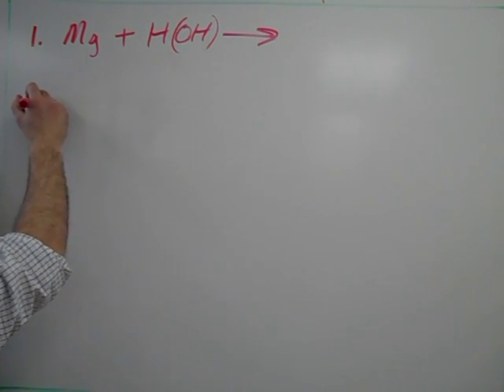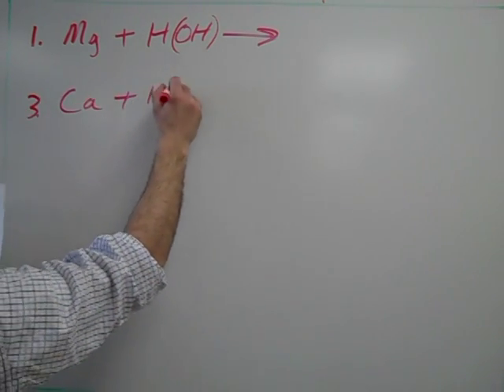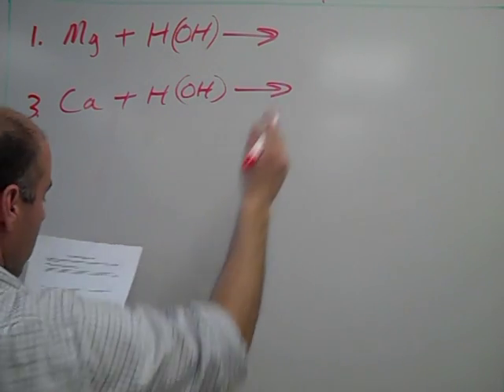Same thing when you do number 3 and you're reacting with calcium.